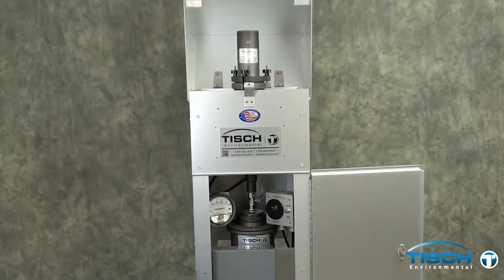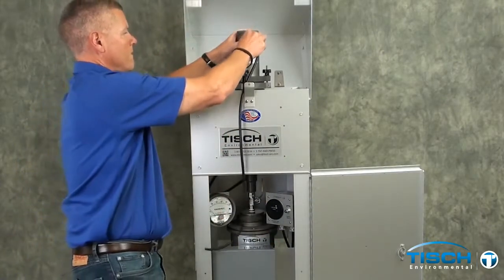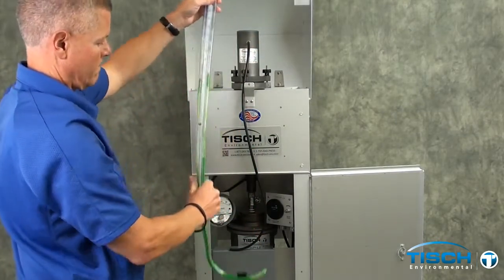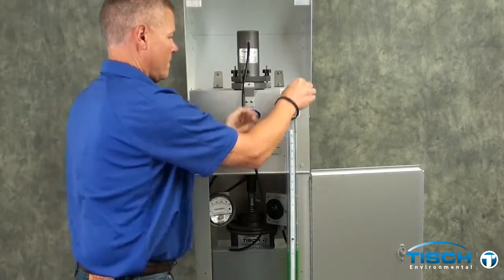The next step is to install the three-foot piece of tubing. Next, you will need to install the TE-5030 30-inch water manometer.